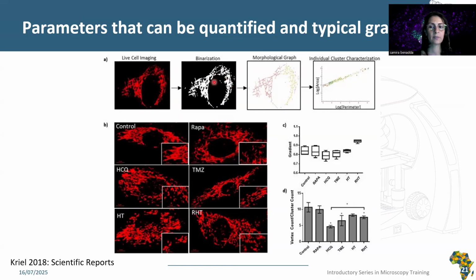Here, we can see the maximal intensity projection of glioma cells stained with MitoTracker Red at 60 times magnification. And after here, we have the means of the different gradients with a different drug. We take the same area here and we can report the same area in different conditions.